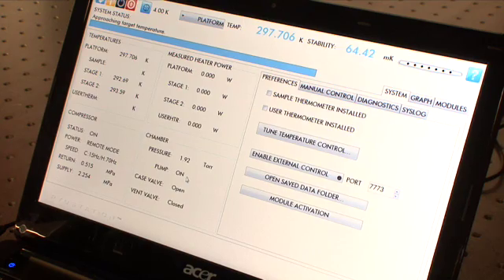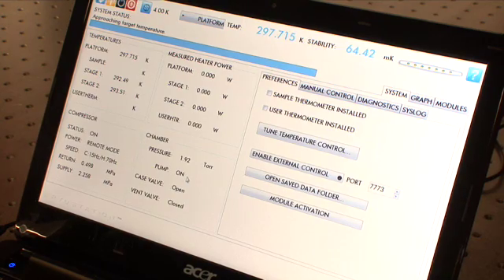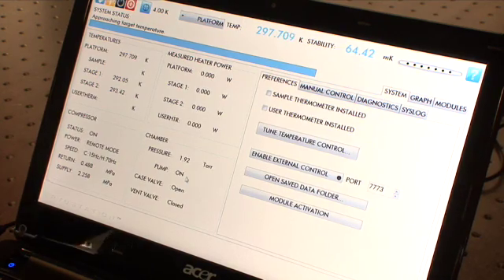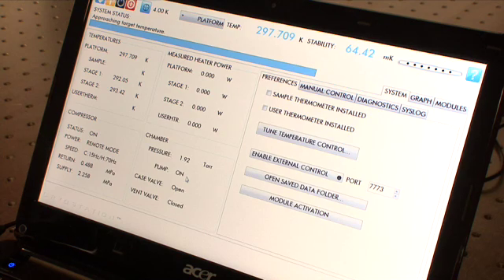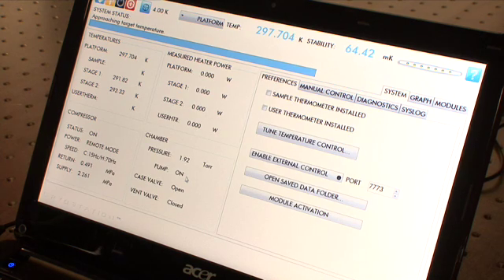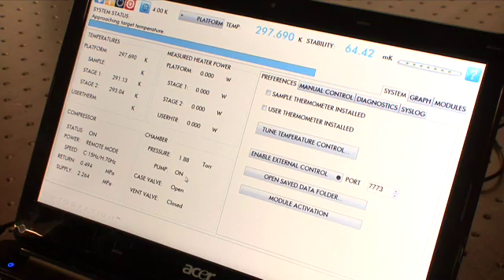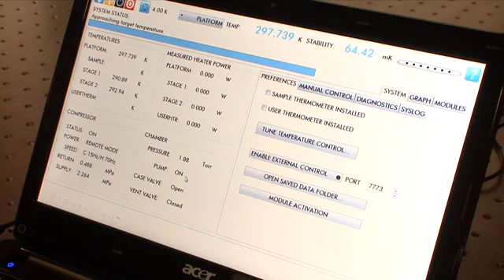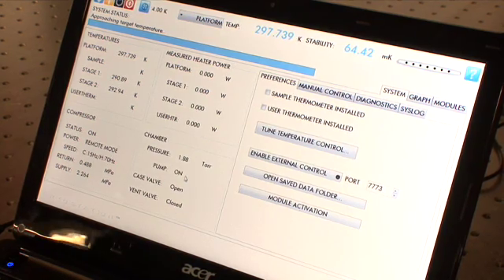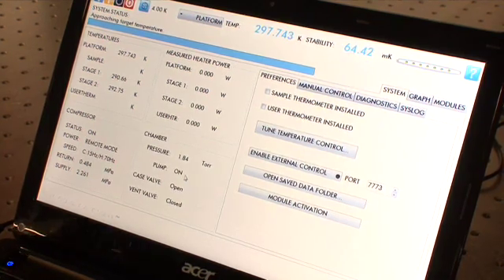Once the compressor turns on, the pump will stay on and the case valve will stay open until the pressure reaches 300 millitorr. Once the pressure reaches 300 millitorr, the cryopumping will begin and the pump will turn off and the case valve will close.